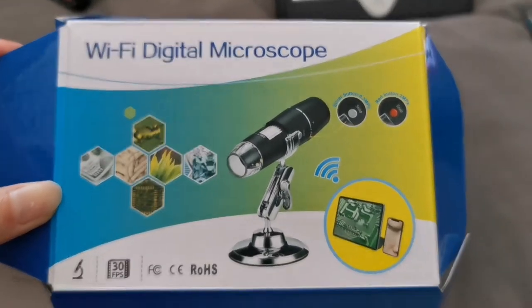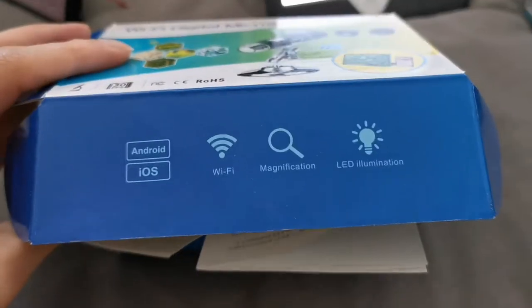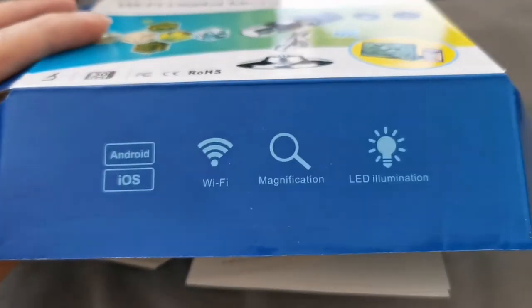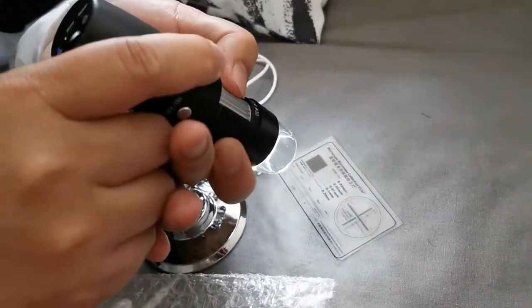Hey guys, so we have here a Wi-Fi digital microscope. We bought this for Prince, but let's see if Prince would know how to use this. We'll try to teach him right now. We're trying to check the device — it's a Wi-Fi digital microscope.